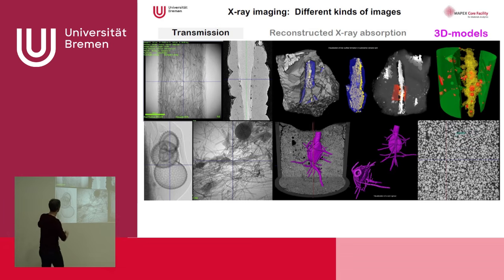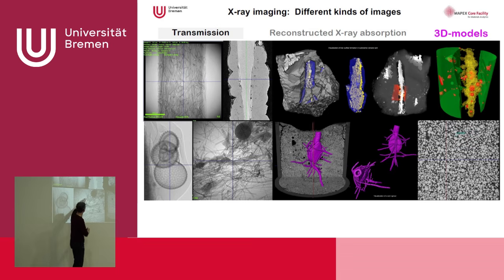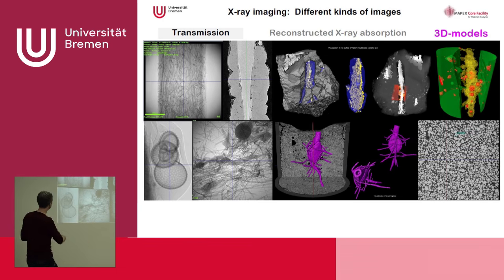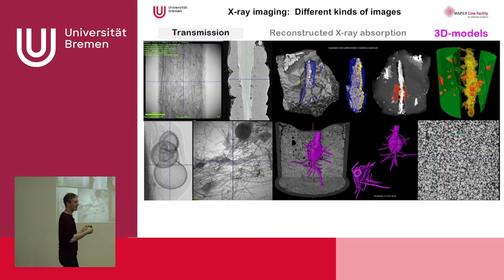The material in the beam absorbs X-rays, and where it's dark, it has a high X-ray absorption. The structure absorbs very much X-rays. Where it's light, not so much. The material is not so dense. So we get an idea about the density and the density contrasts from these transmission images, which will later be reconstructed to 3-dimensional volume images of the X-ray absorption.